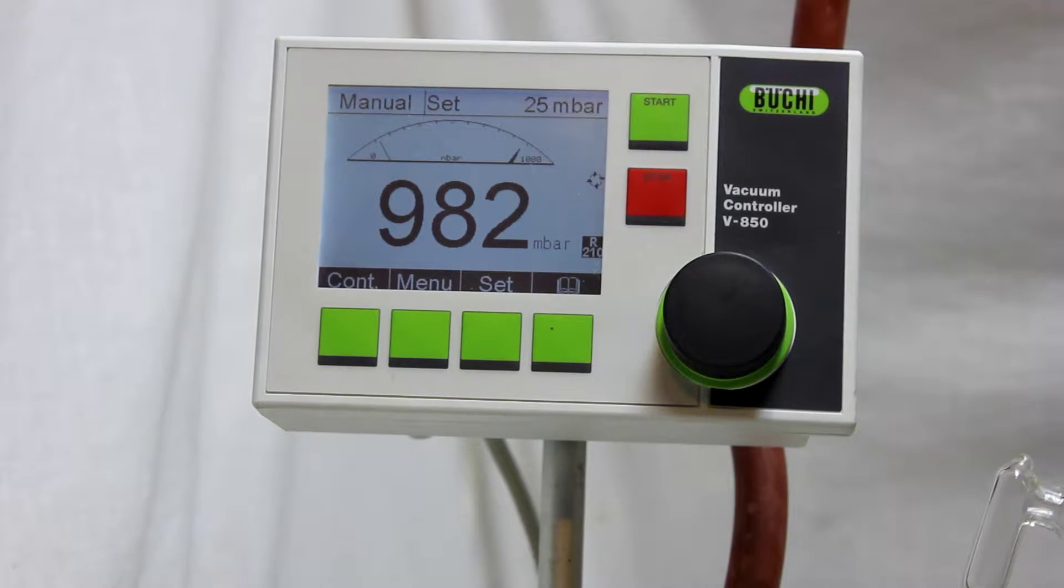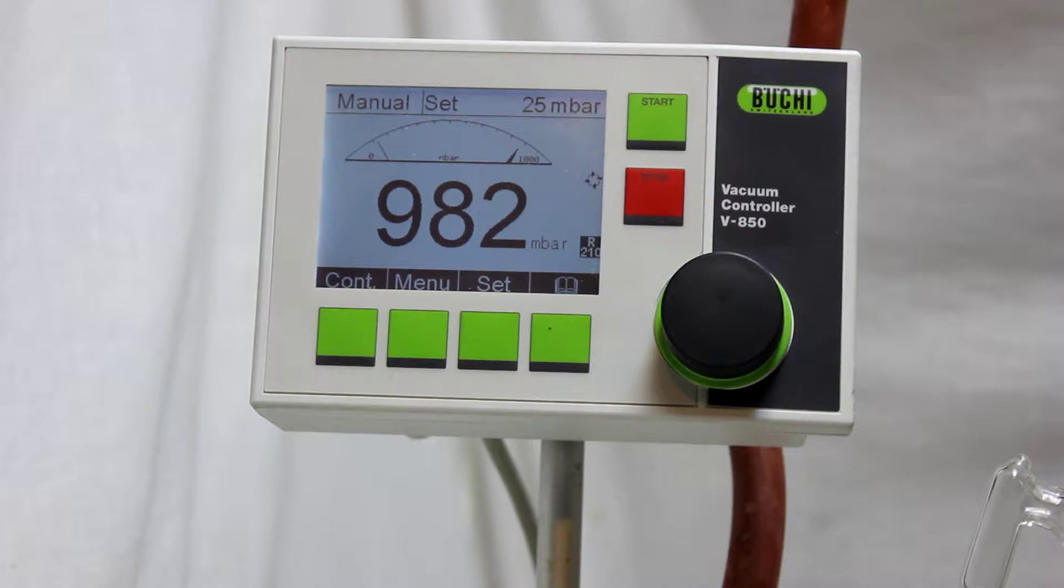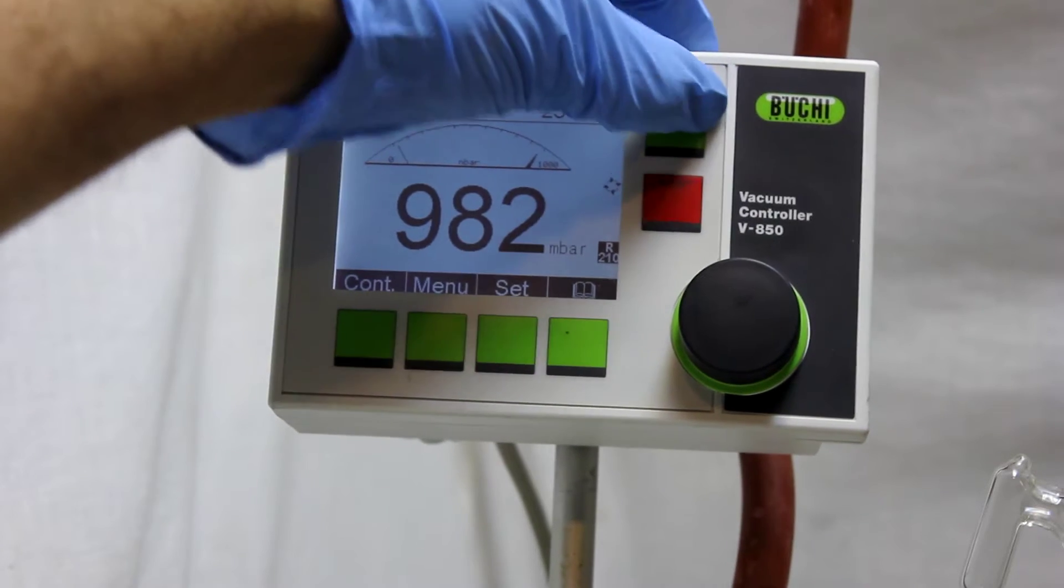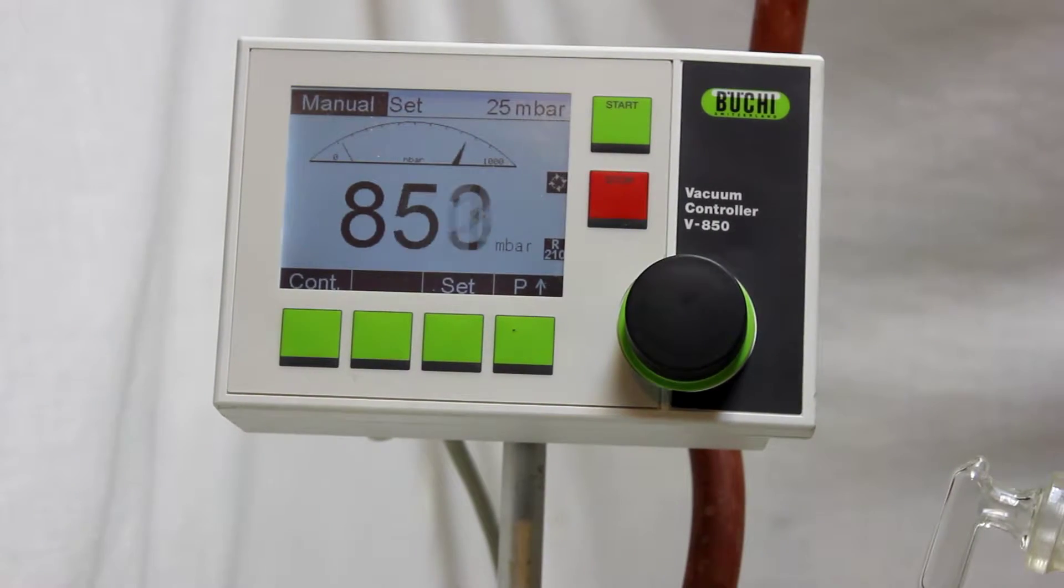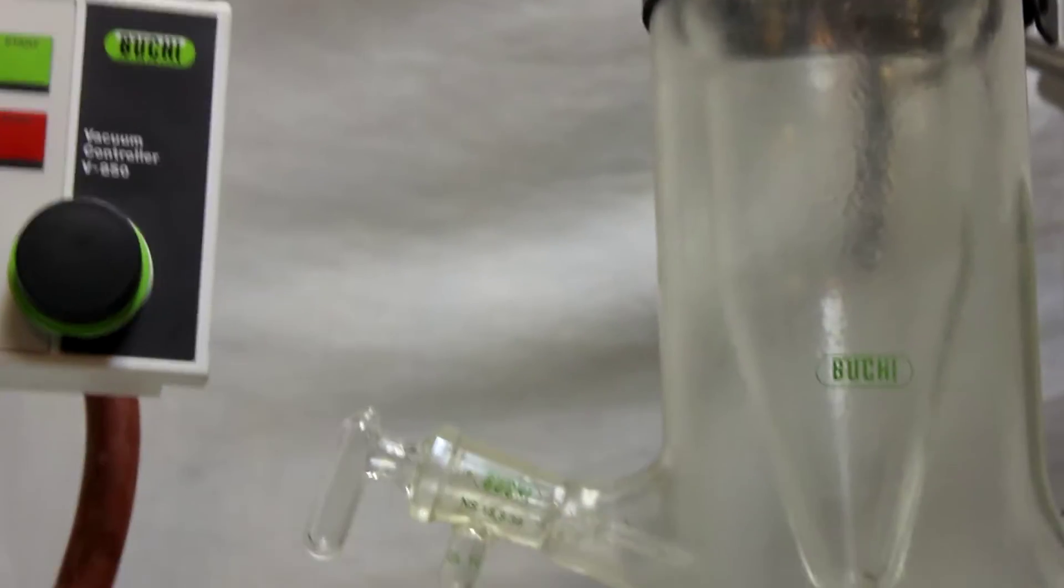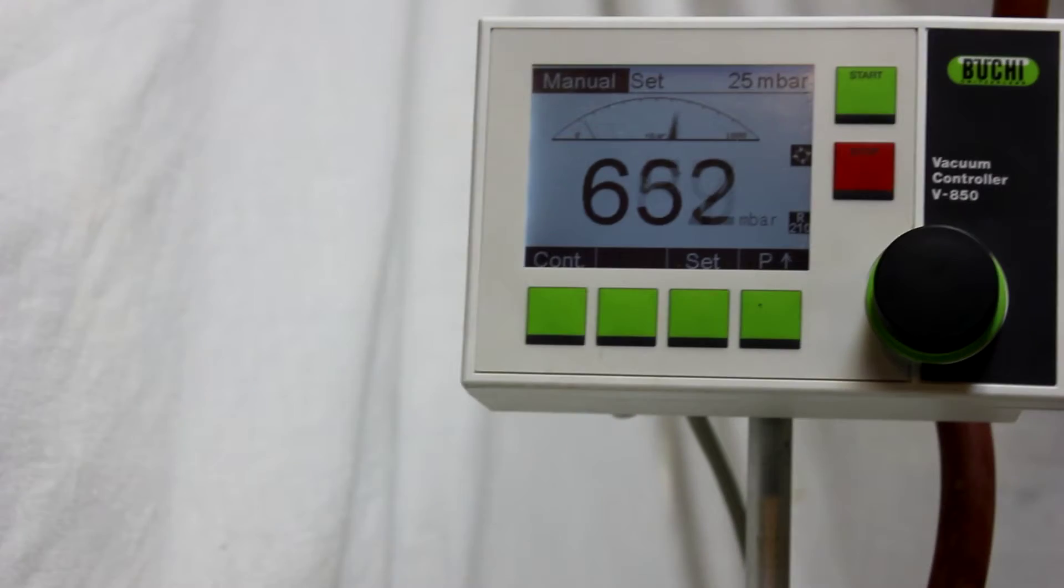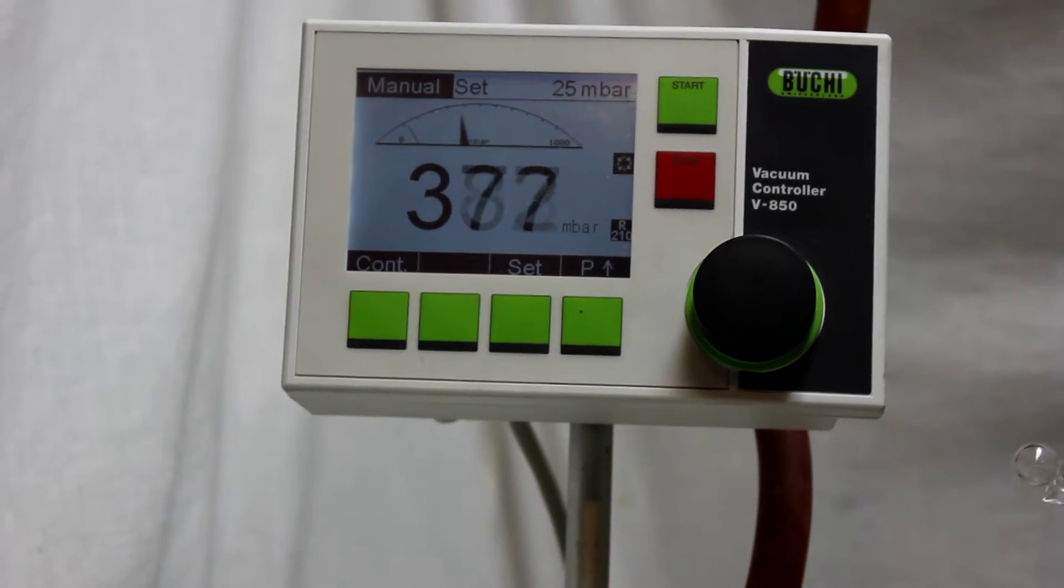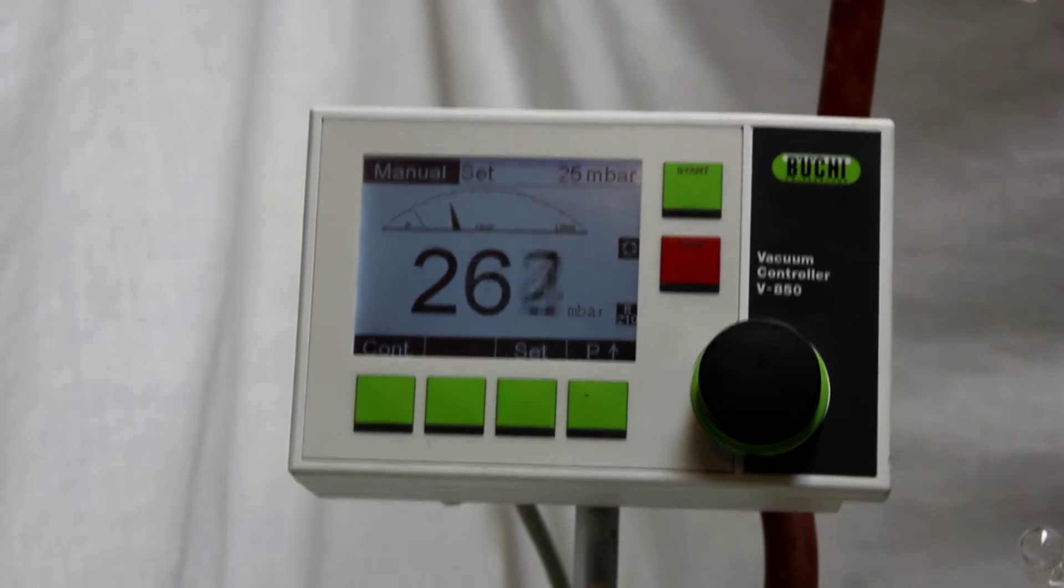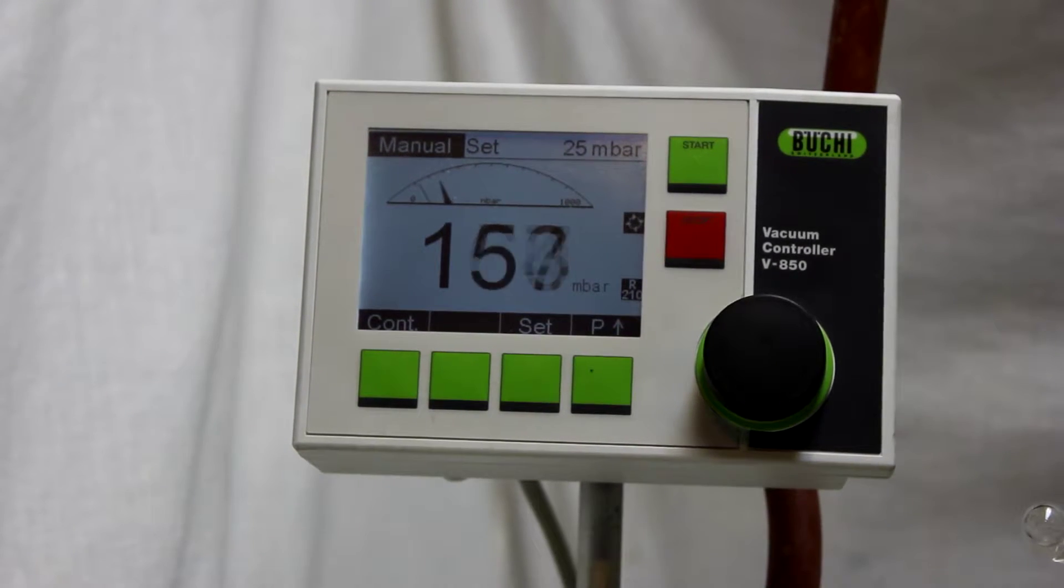So let's set it up with 24 millibar preset. I'm going to ask it to start, so start vacuuming. But the valve is open, so let's just close the valve and immediately you can see it's just gonna go under vacuum, and actually it goes very fast.